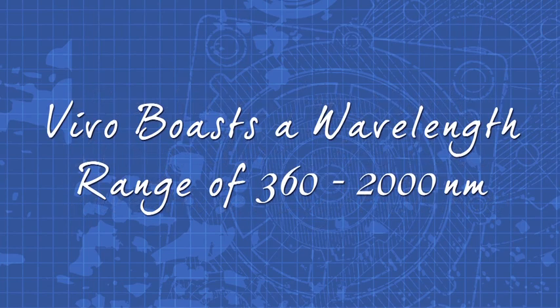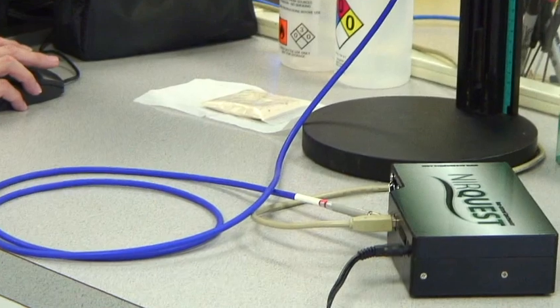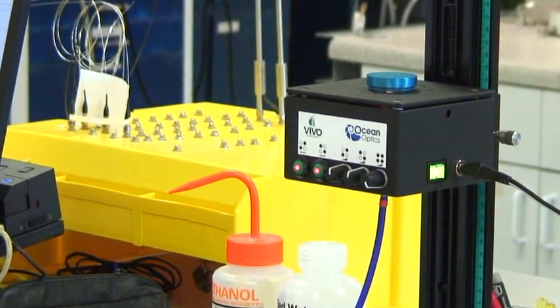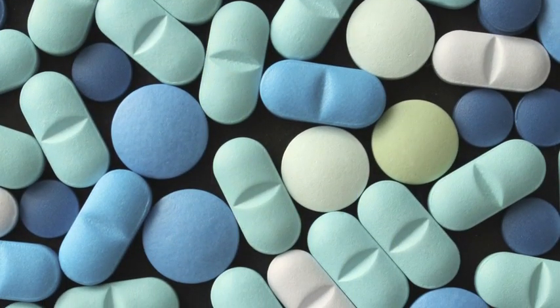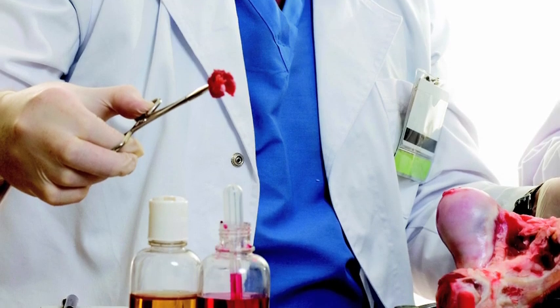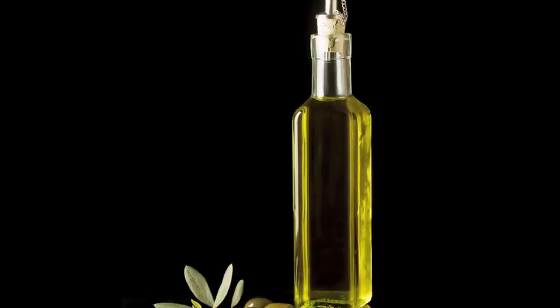With a wavelength range of 360 to 2,000 nanometers, Vivo is a great choice for any application where a broadband VIS NIR source is necessary. Vivo is especially useful for applications like pharmaceutical analysis, food safety, and analysis of grains and oils.